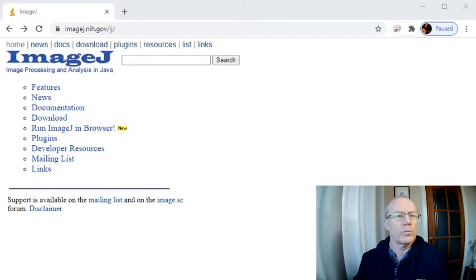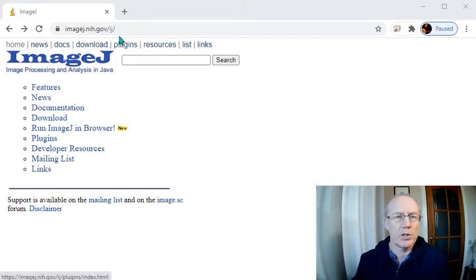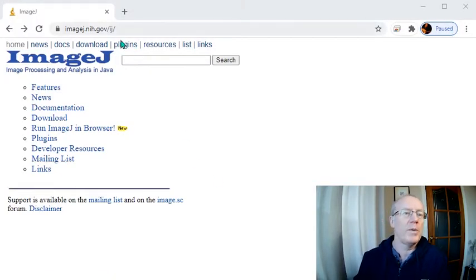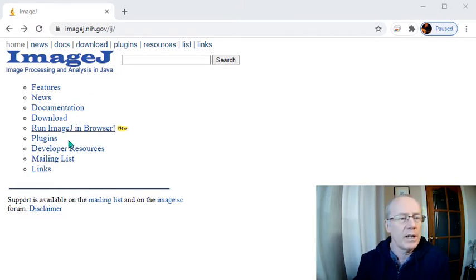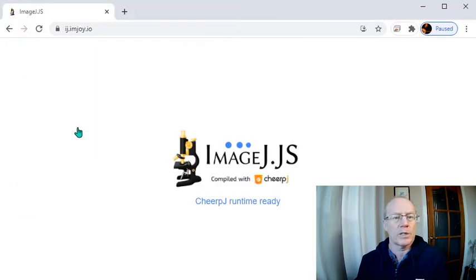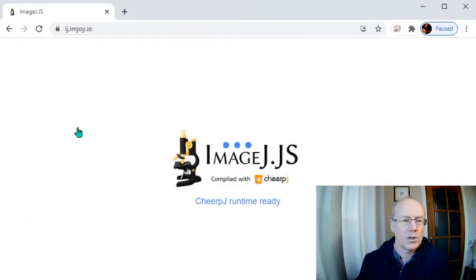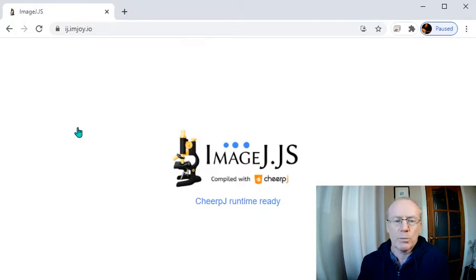All right, we begin by going to the ImageJ homepage. Just do a search for ImageJ and you'll find run ImageJ in a browser. It should load up pretty quickly.